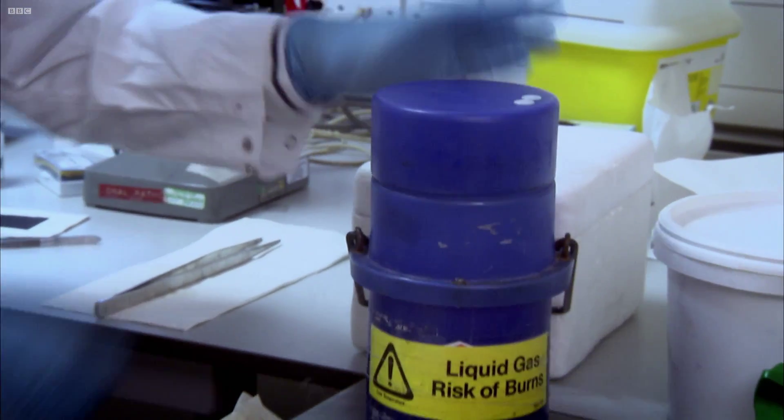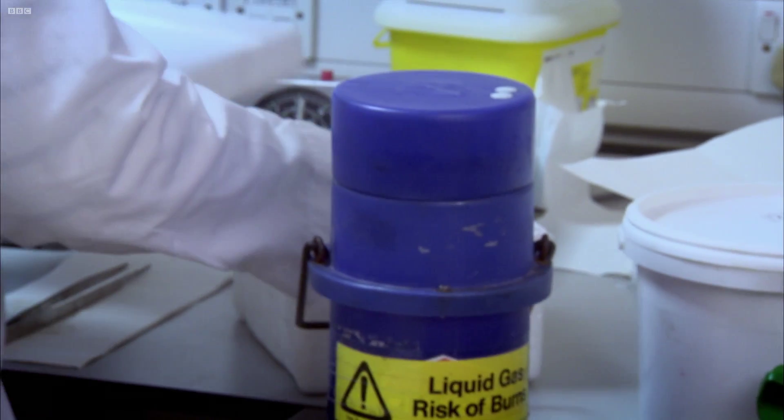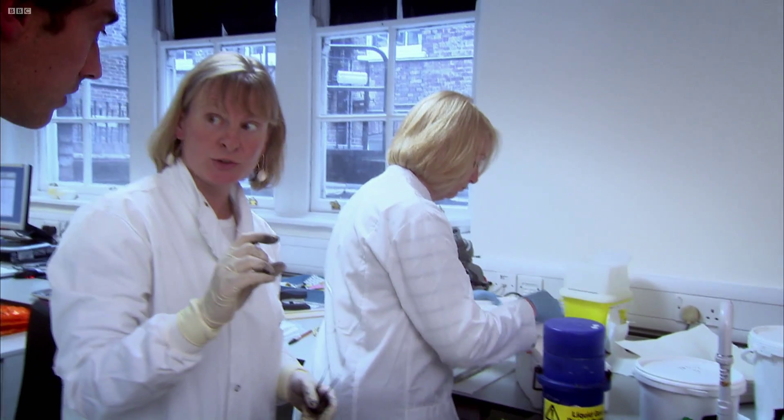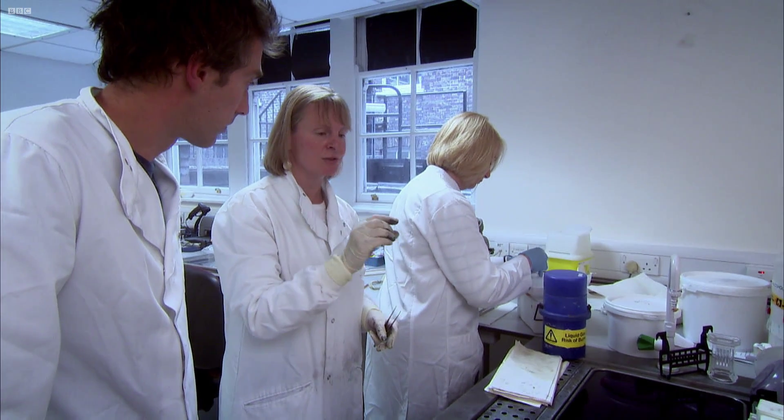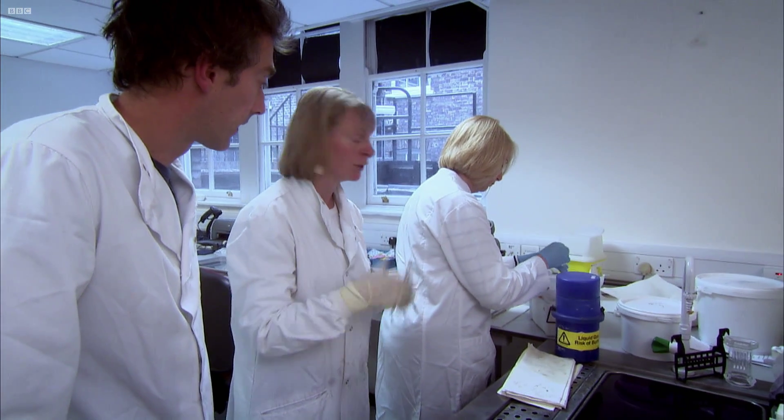Sally then transfers those pieces of tissue into small tubes, which allows each piece to be banked separately for long-term storage.